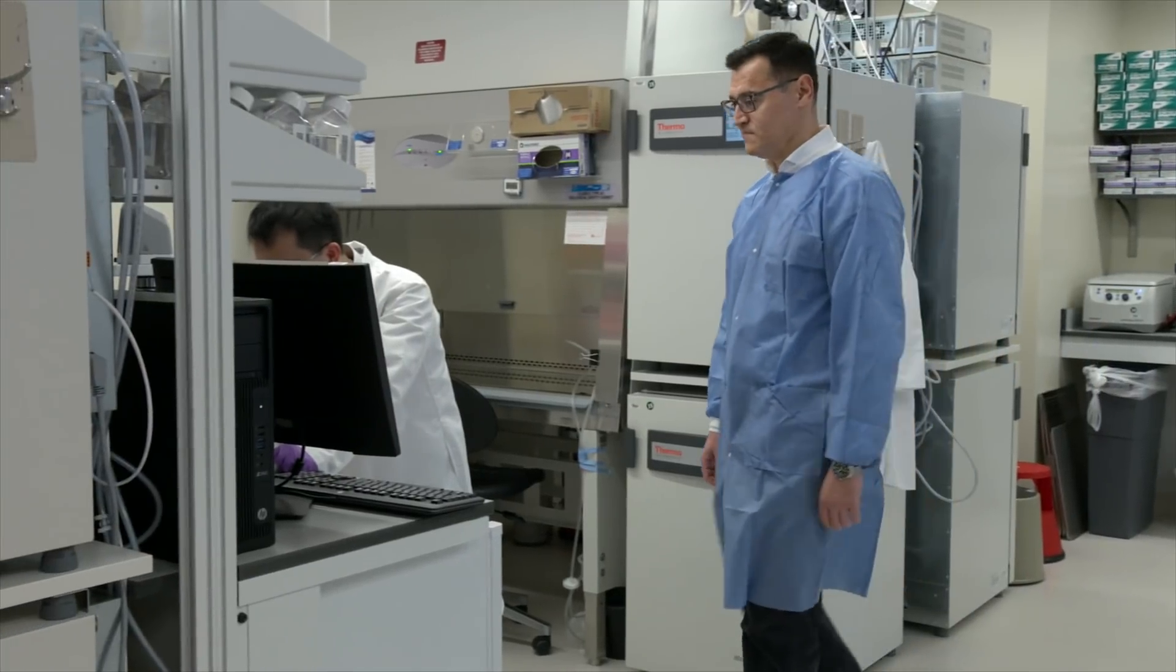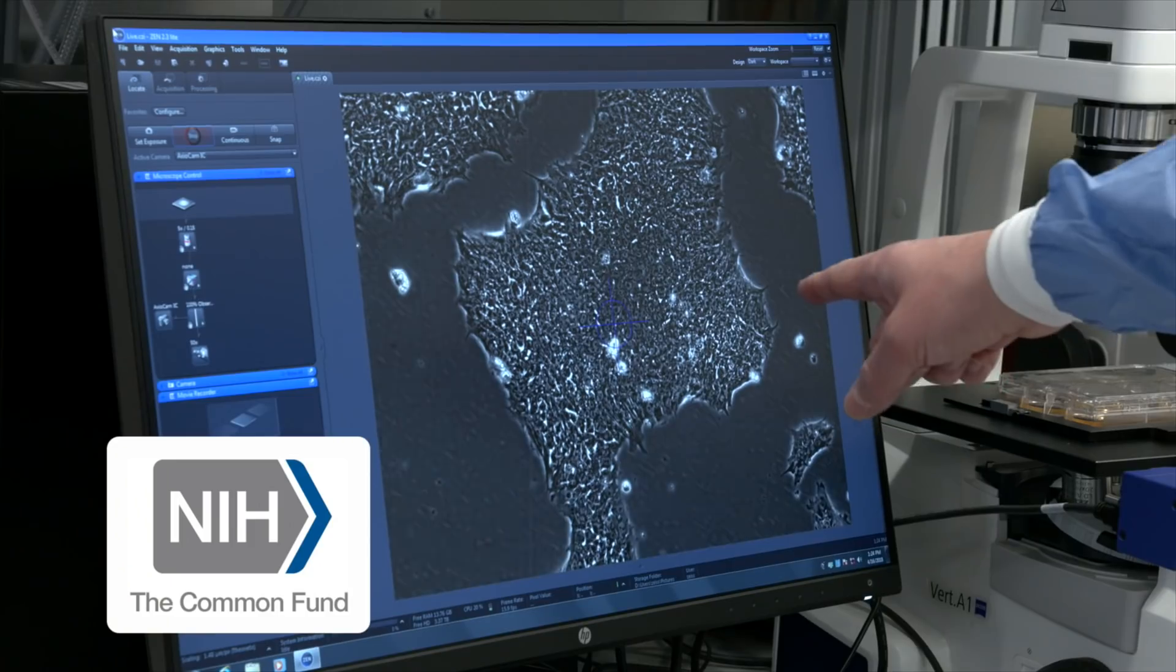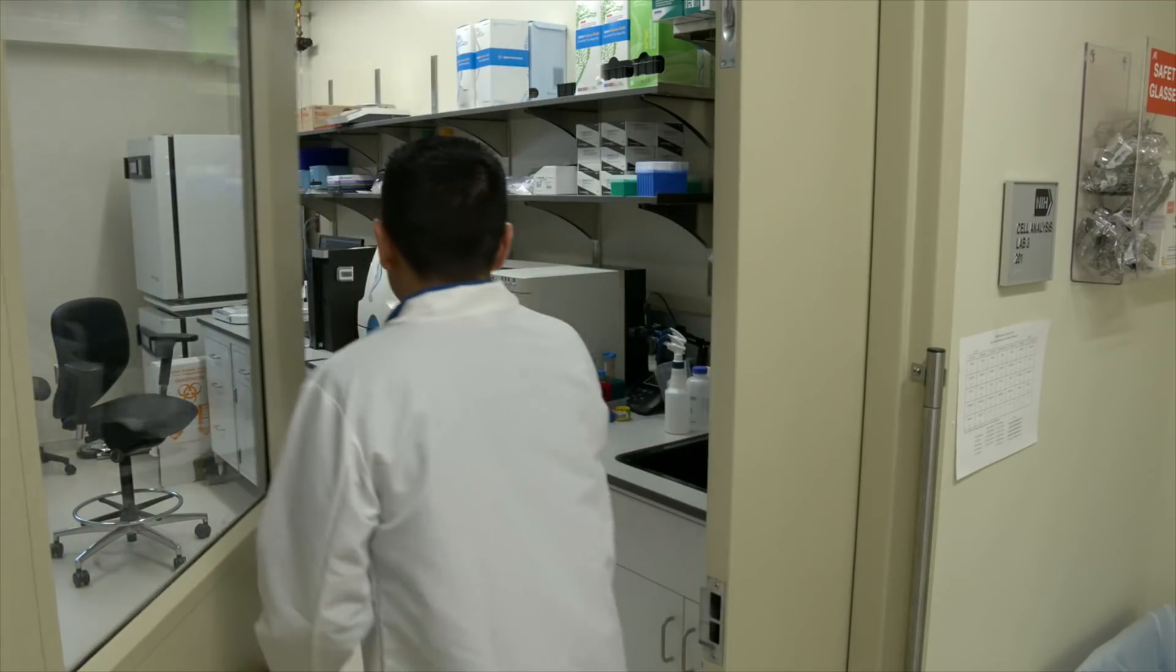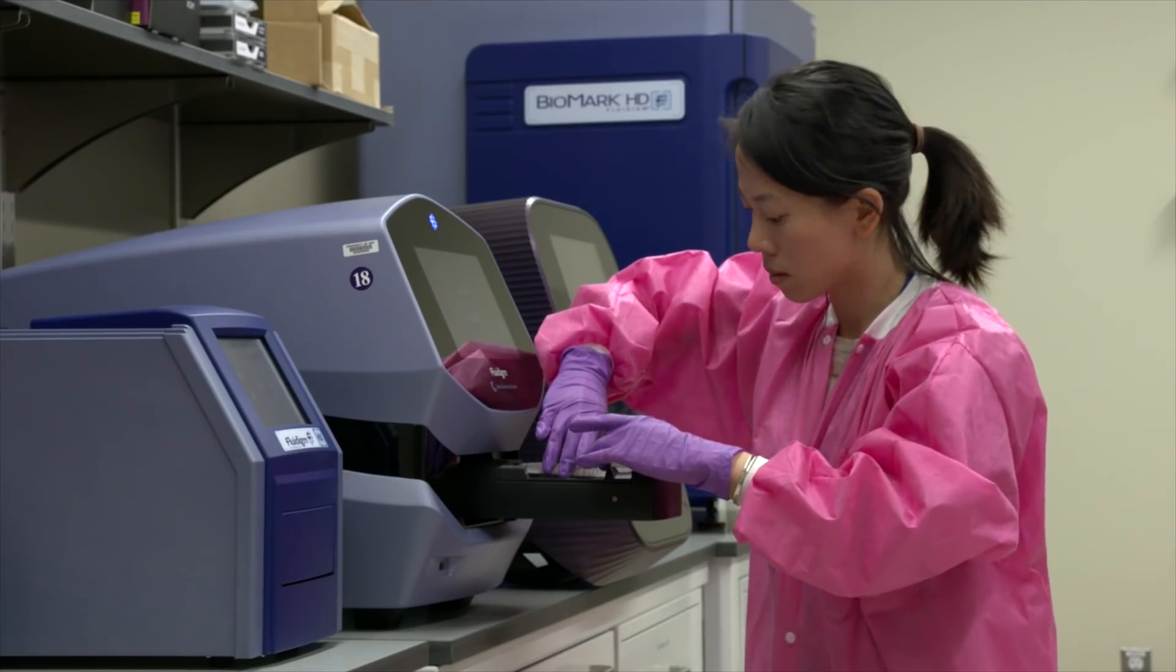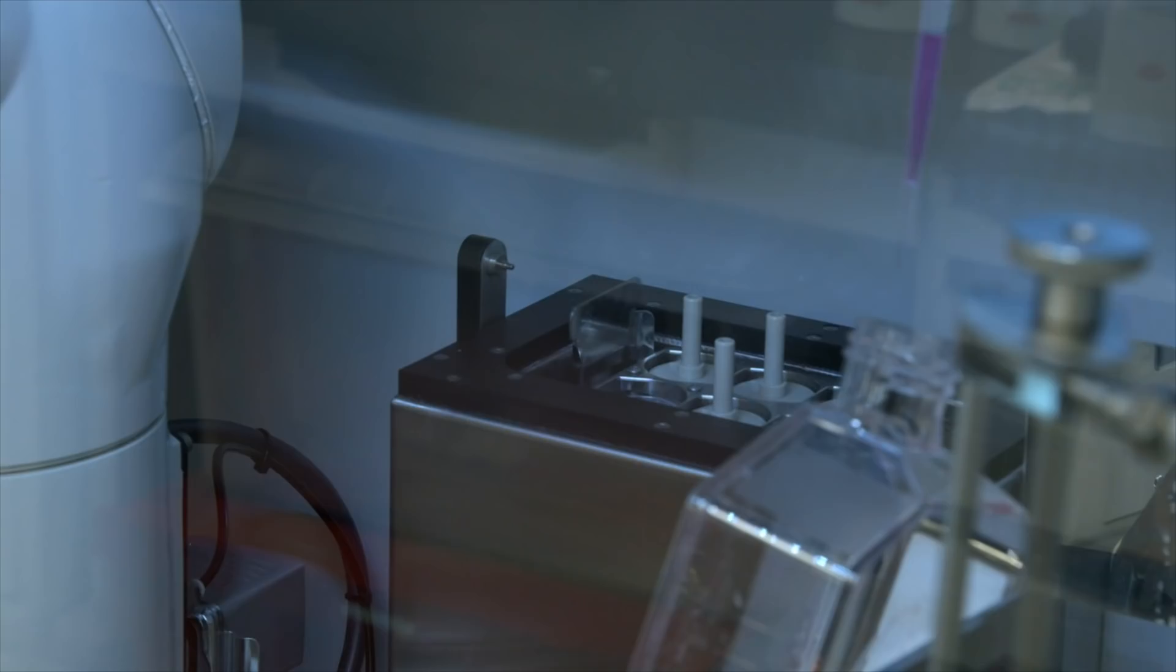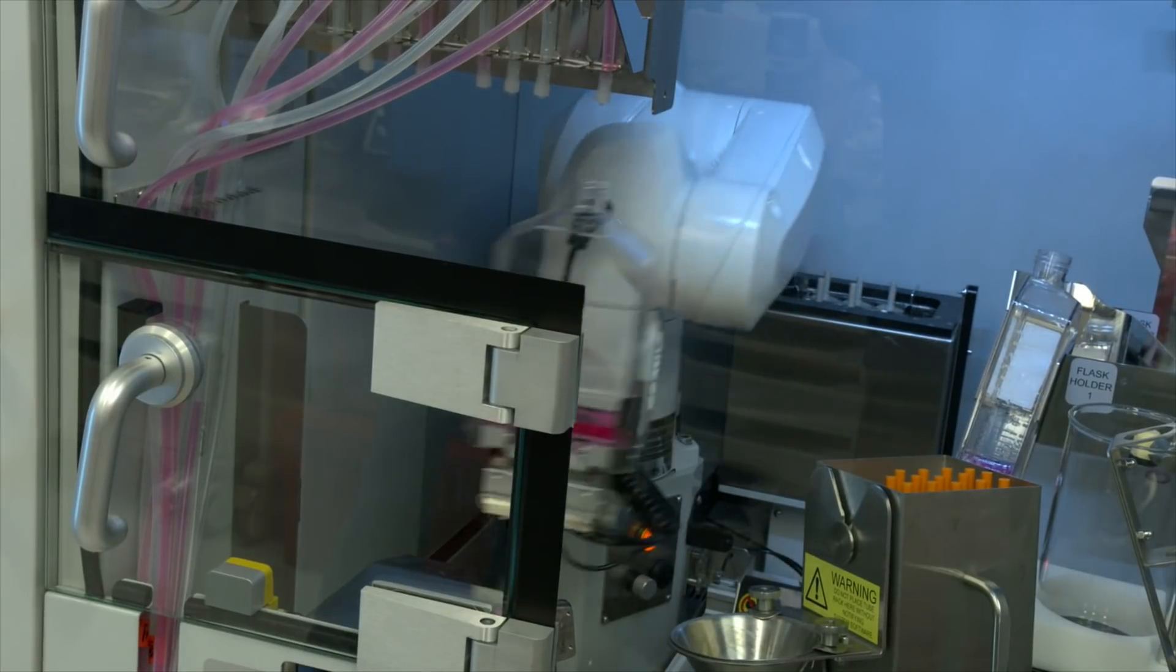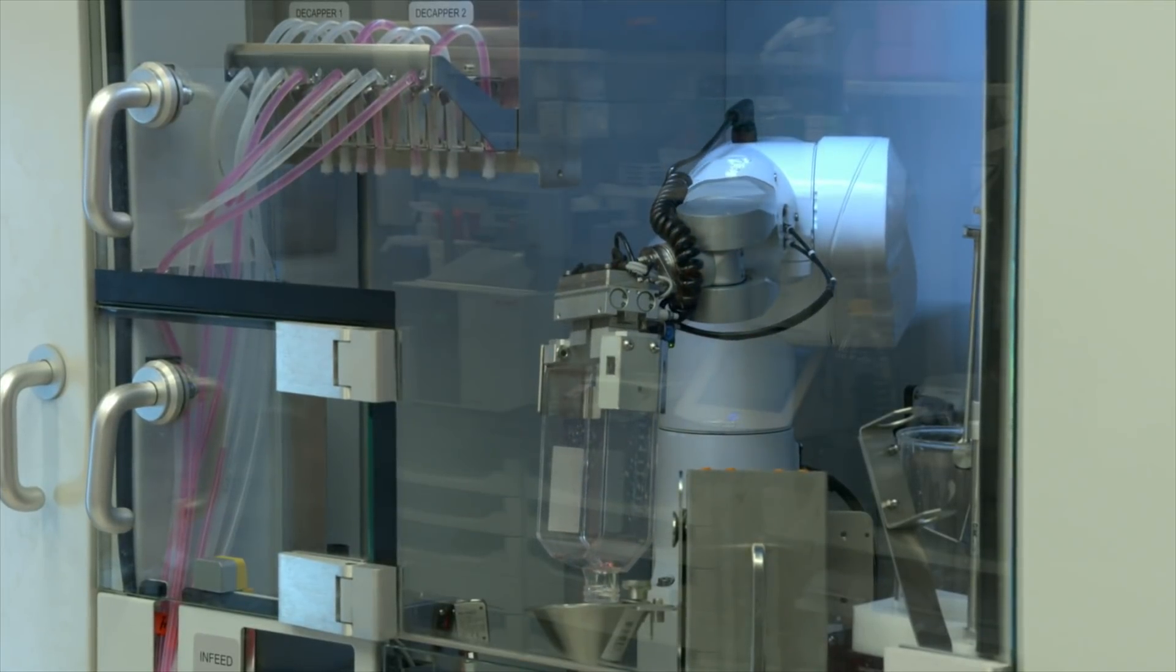NCATS Stem Cell Translation Laboratory is supported through the NIH Common Fund's Regenerative Medicine Program. This state-of-the-art, 4,400-square-foot facility is outfitted with the most cutting-edge research technologies. For example, to increase efficiencies, NCATS scientists use a robotic cell culture system that enables the standardized expansion of nearly 100 different stem cell lines in parallel.